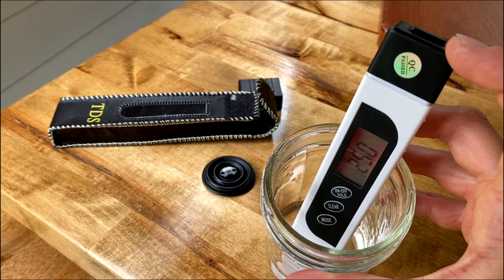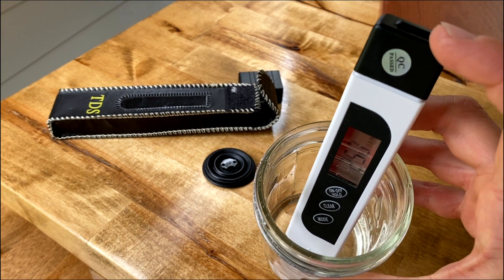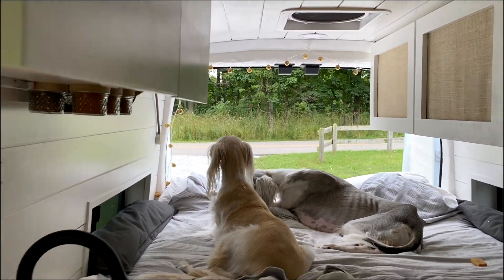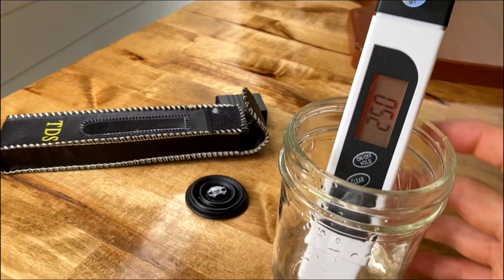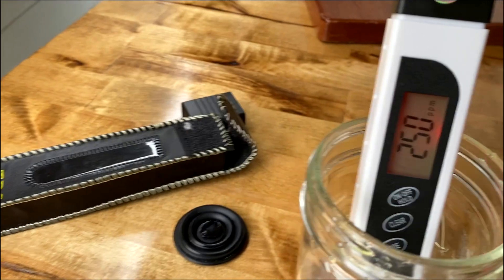250. I like it. Can you imagine this filter takes a hundred points off of it? Yeah. In this particular case scenario.